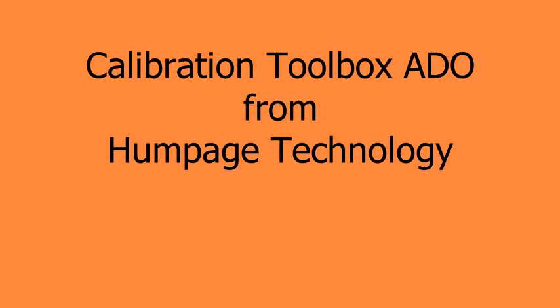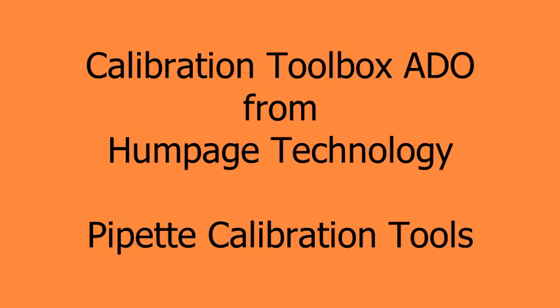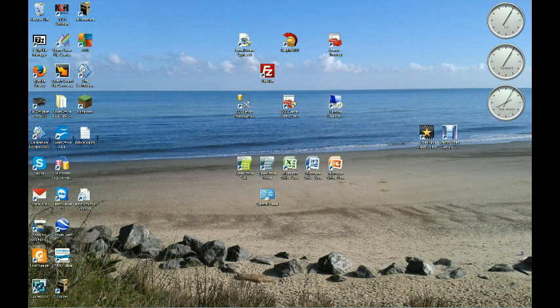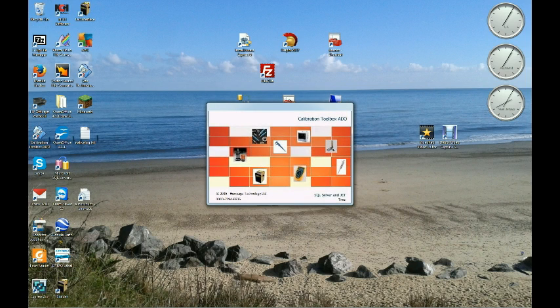Welcome to this series of short video tutorials on Calibration Toolbox ADO, calibration management software. In this tutorial we're going to concentrate on the Pipette calibration facility. This enables you to calibrate pipettes efficiently, accurately, quickly and easily.